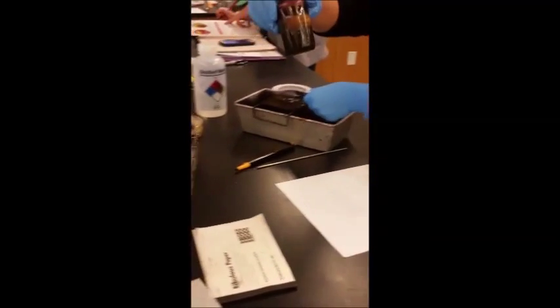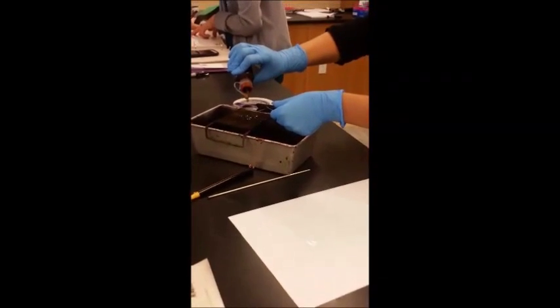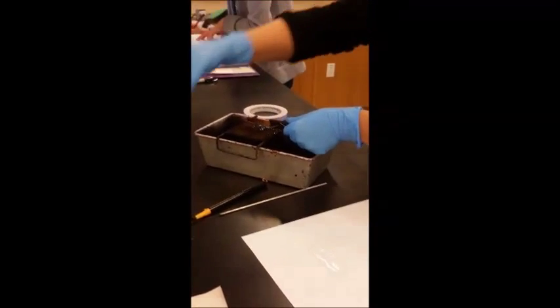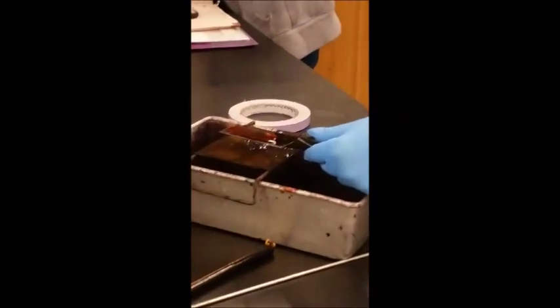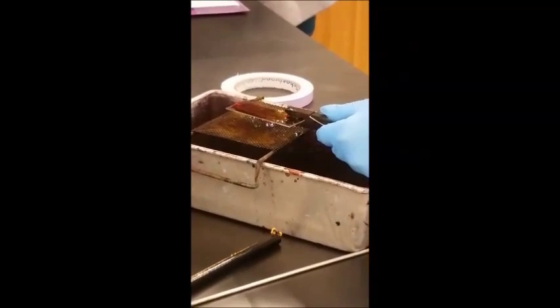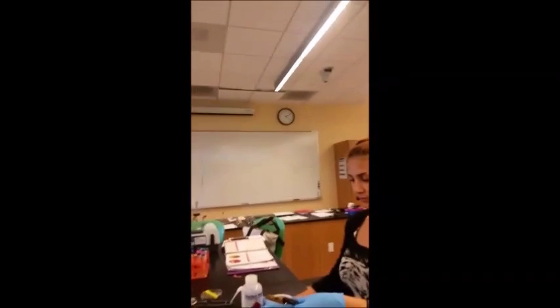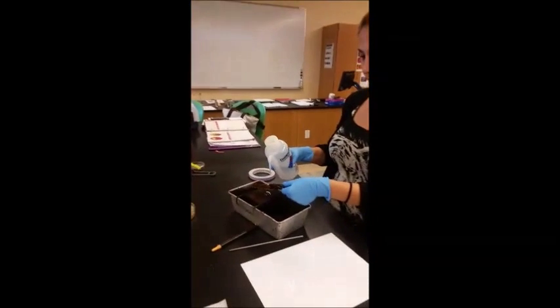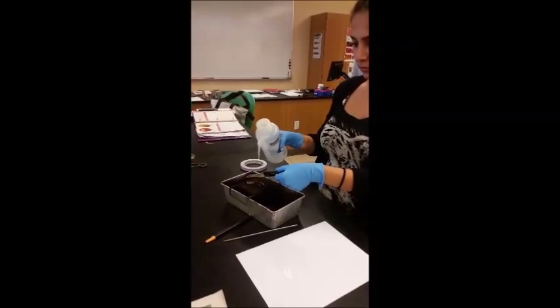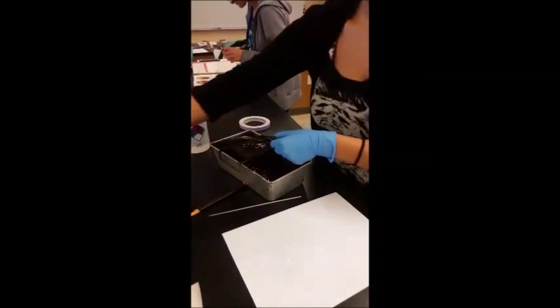And then after that we use the second dye, which is the iodine. We add a few drops on the slide and let it sit the same amount of time as the crystal violet, just 1 minute. After 1 minute, we wash off the iodine from the slide. Make sure it's clear and there's no dye left on the slide.